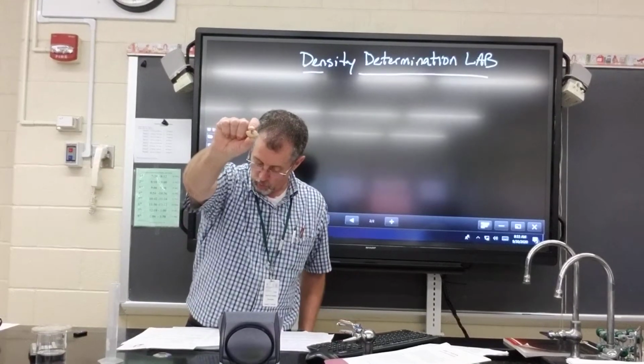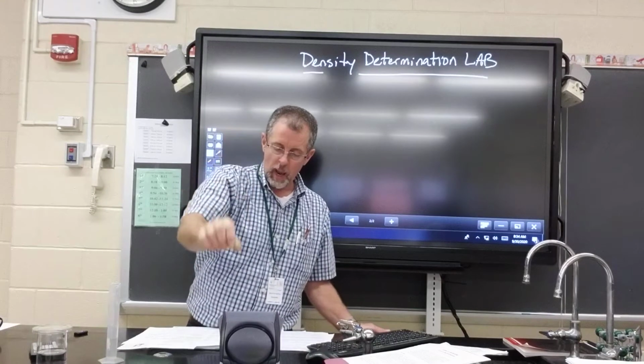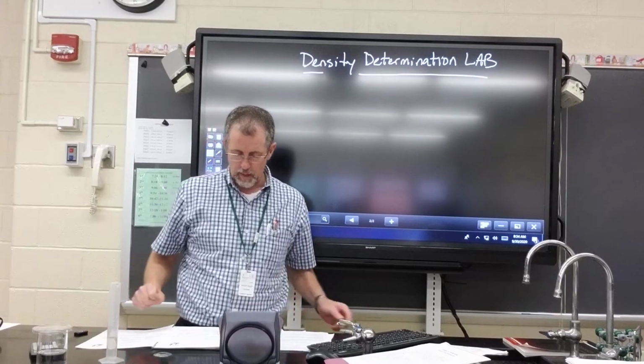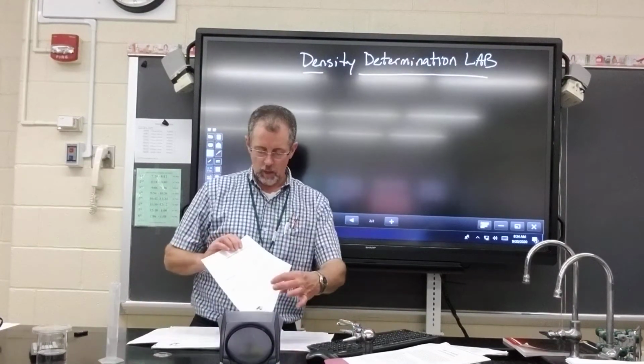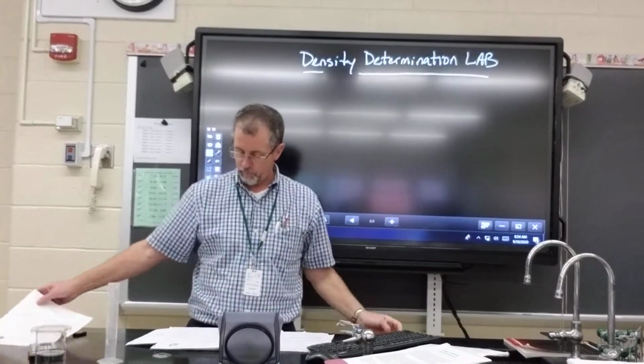So on your letter for table A, you will write down E. So E is the letter for this rock, and we're going to take the mass of the rock. So when I take the mass of the rock it is 10.19. So I record right there 10.19.